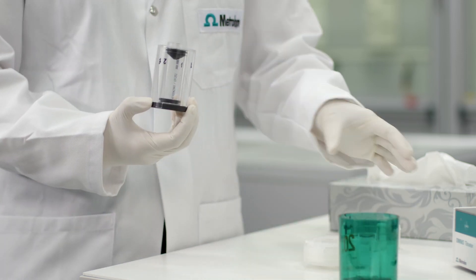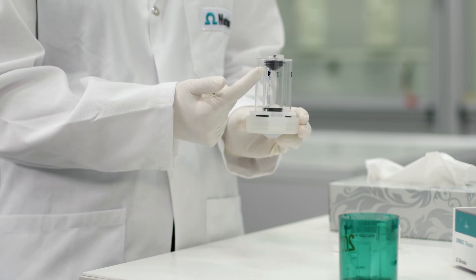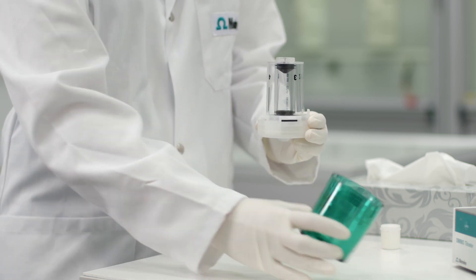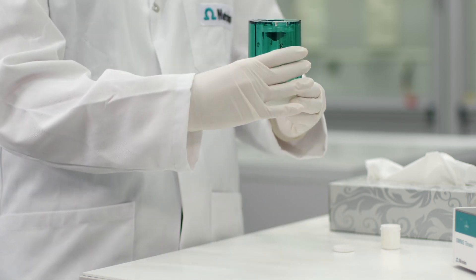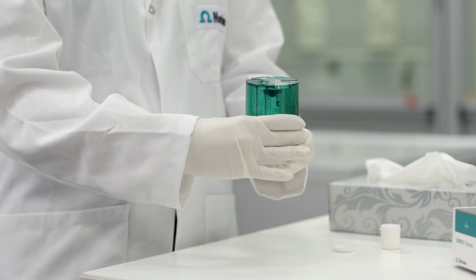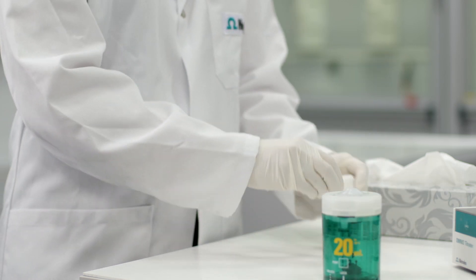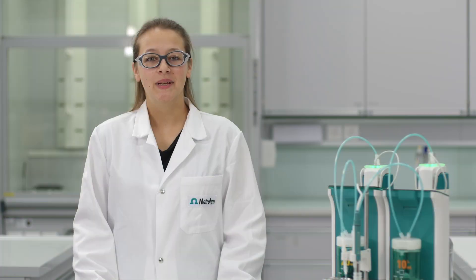Finally, assemble the cylinder unit. Align the marking on the cylinder element with the marking of the distributor. Cover the cylinder element with the housing and make sure the markings are aligned. Rotate the cylinder housing to the left until it snaps into place.